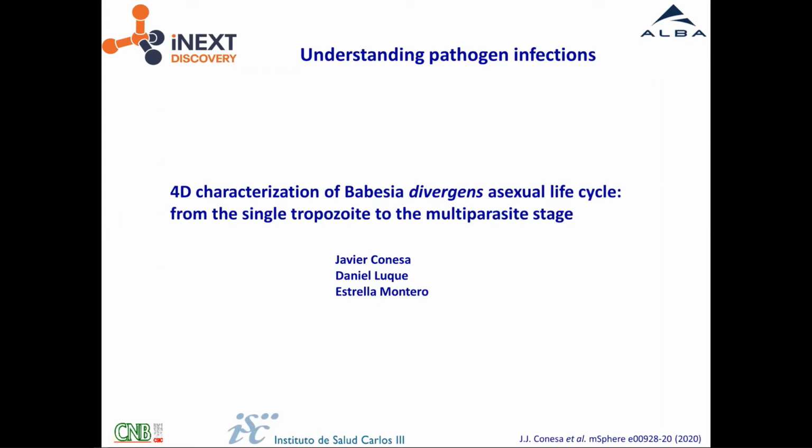In this case, Javier Conesa, who was a postdoc at the Beamline until last year, he was interested in looking and understanding the asexual life of Babesia, which is a parasite that is infecting vertebrates, not only wild, but also domestic animals and also humans.